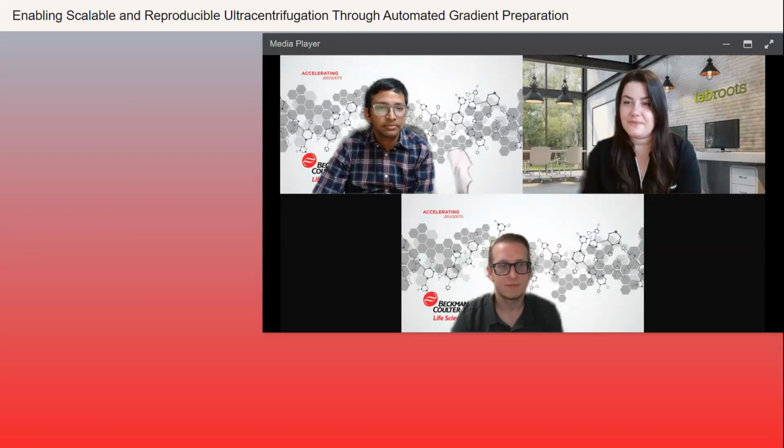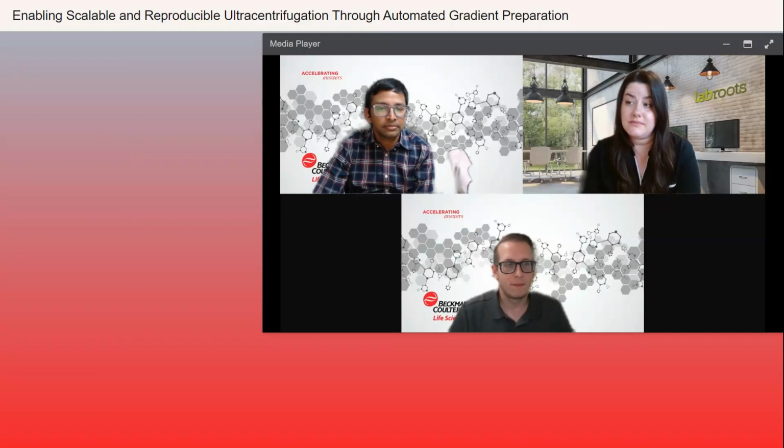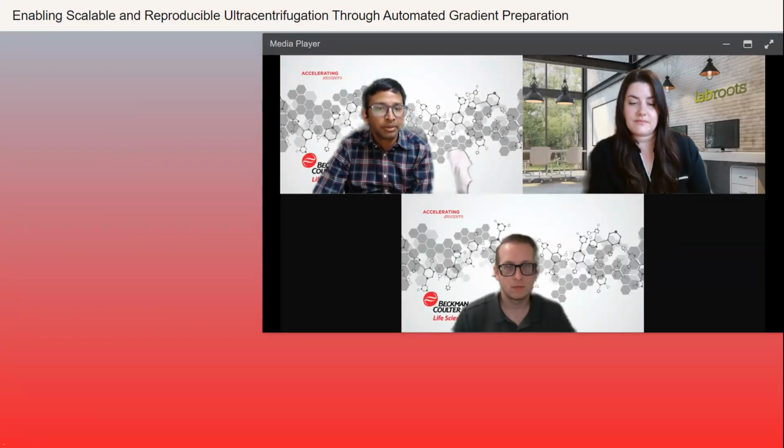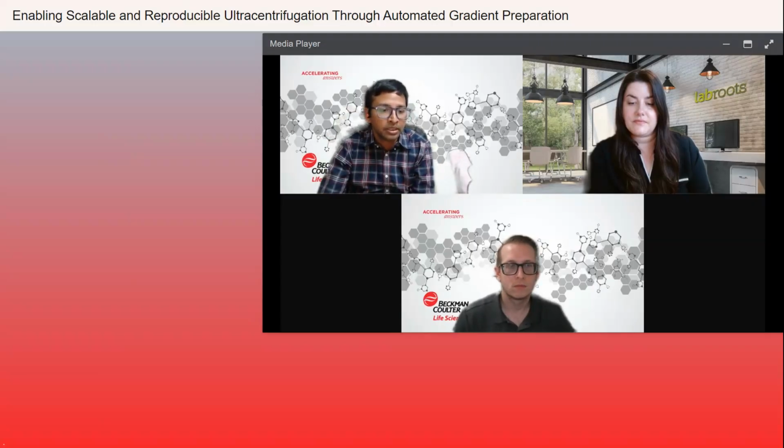Excellent, thank you. All right, our next question is over to you, Bala. This question is asking how to recover precious samples that are used in priming, calibration, and remaining in the tubing, and how to minimize sample waste. This is an important one. Thanks for the question. I guess there are 3 points where you have a risk of some amount of sample wastage. It is when you're doing priming, calibration, or when you're recovering post the dispense, right?